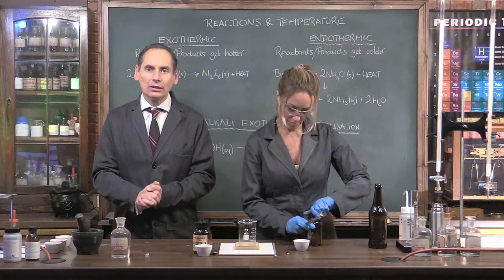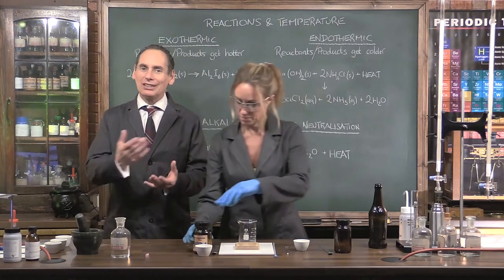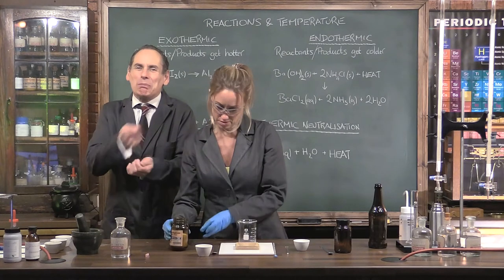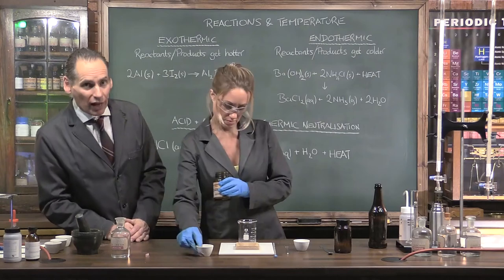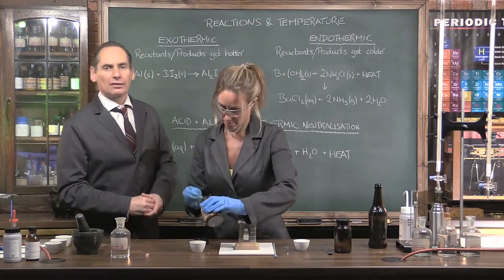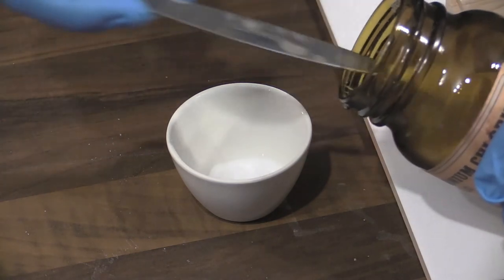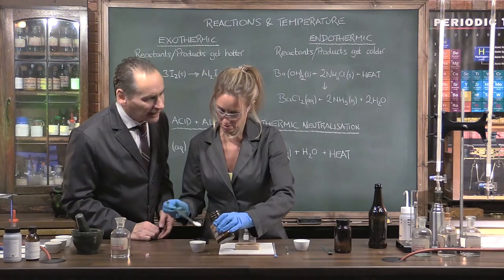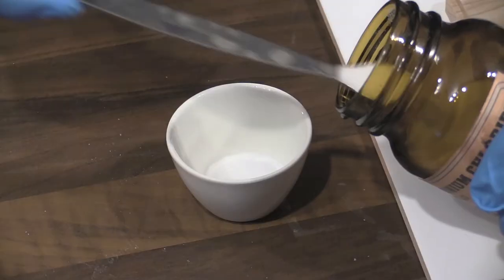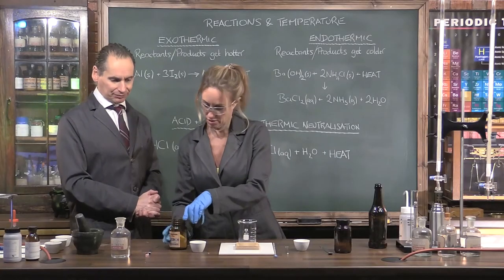And now the same number of spoonfuls, but you won't get the same. It doesn't pile up so much. This is ammonium chloride. So, about five of these, I think. Oh, yes. Well, I actually just did four very good ones. Let's have a look. I think you might need another one. There we are. That's sufficient? That is absolutely perfect. Righty-ho.